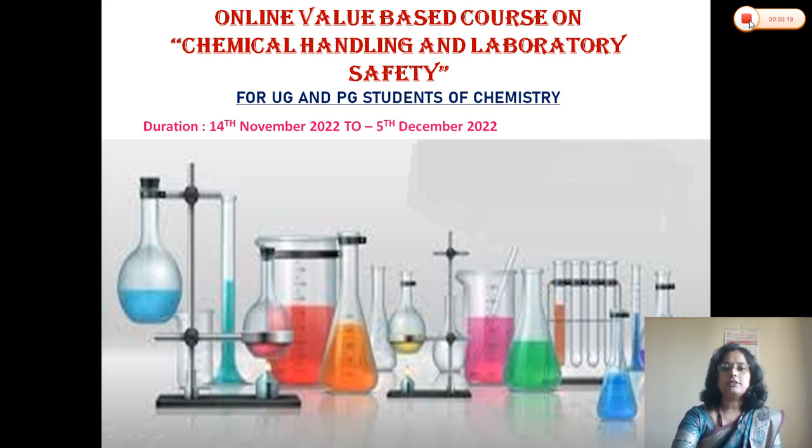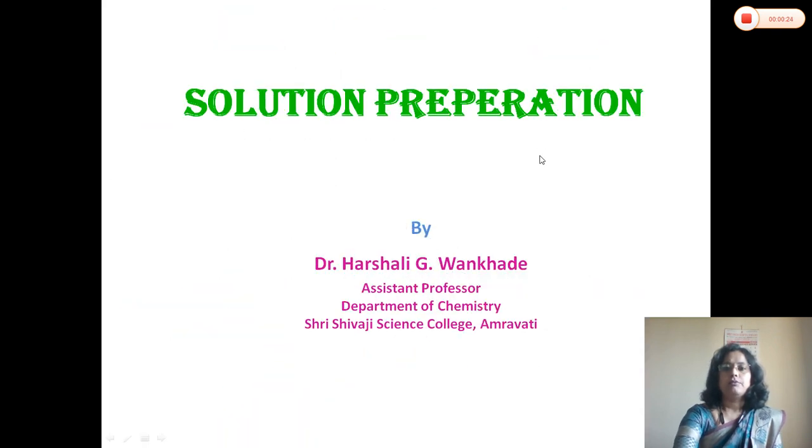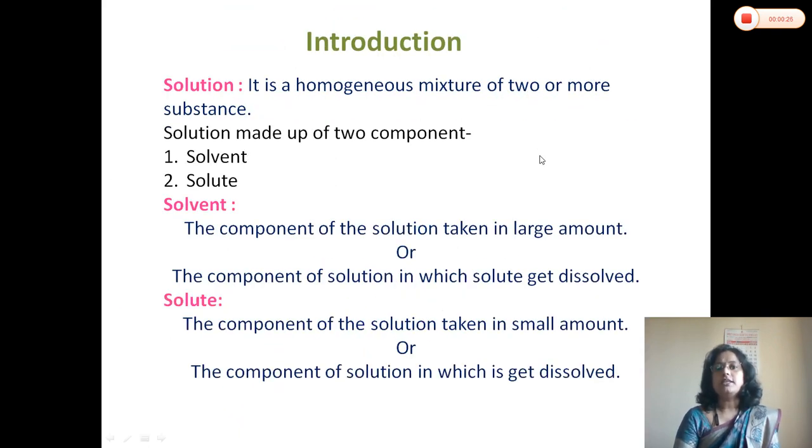Today we are going to discuss solution preparation. The very first question is, what is a solution? Actually, a solution is a homogeneous mixture of two or more substances in a variable composition. So, to prepare a solution, we require at least two components.